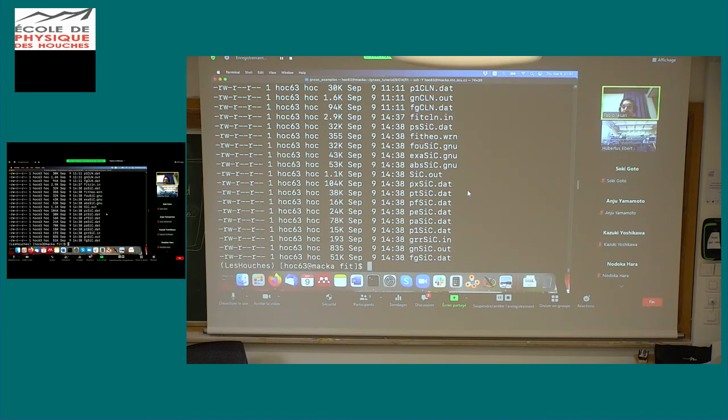but there are various files that can be seen with top drawer. So PA is just the GNXAS and PF is the Fourier Transform. PT shows you the n-body expansion of the fitting, and the PX shows you the multiple scattering expansion of the fitting. So all the various signals that we put, various levels of details of the fitting.